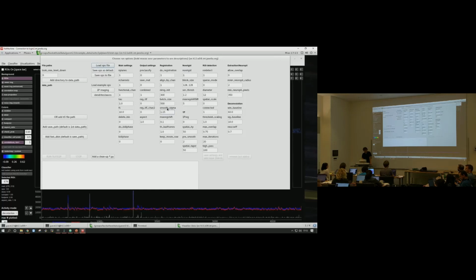Yeah, I moused over it. It says right there: this is a threshold on the bad frames. So for this threshold, 1 doesn't mean the threshold is 1. It has some hard-coded value in there. I don't remember what it is. But you can adjust it relative to this value, right? So if you want more of your frames to be called bad, because they're not well correlated with the reference, then you increase this threshold. If you want to be more permissive, you decrease the threshold. Whether you want to keep the raw movie, so you already did this to get both the raw movie in the viewer and the aligned movie.